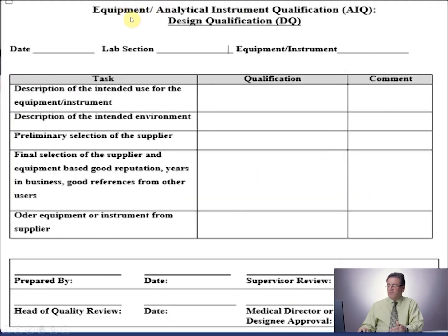The end user, which means the medical director or designee, has the ultimate responsibility for the accuracy of the results of the qualification of their equipment or instrument. This is just a table that has the qualification phase and the responsibility of who. I said it could be the user, the vendor, or a third party, so this is not really accurate. And these are some of the activities that you need to do during each stage.